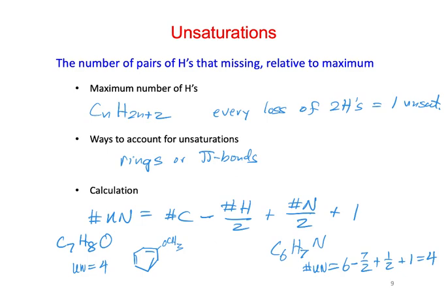So this could be consistent with something like aniline, right? 4 unsaturations. It could be consistent with something like a pyridine with a methyl group on it.